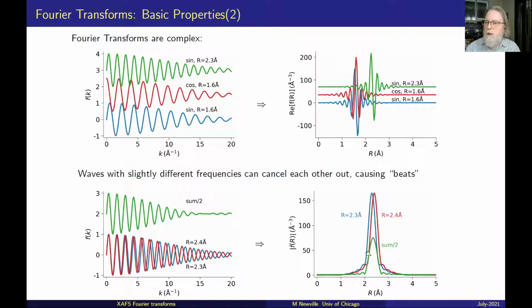So the amplitude itself of the Fourier transform does not necessarily give an indication of the weight of the oscillation fully. It also includes this effect of weighting or reduction from this disorder that's added to the spectra. So I guess what I'm trying to say is that the blue and the red curve adding together give the green curve, not something that's twice as big. So mapping the height of this peak onto coordination number is challenging because it also includes this disorder term, this decay term.